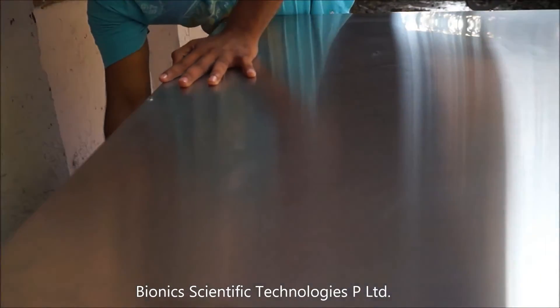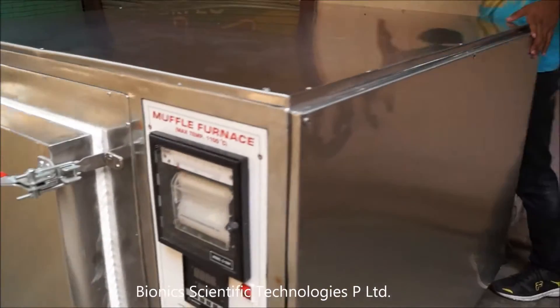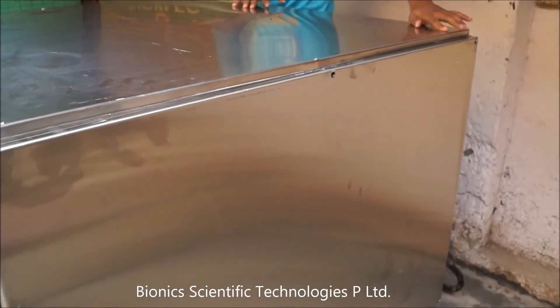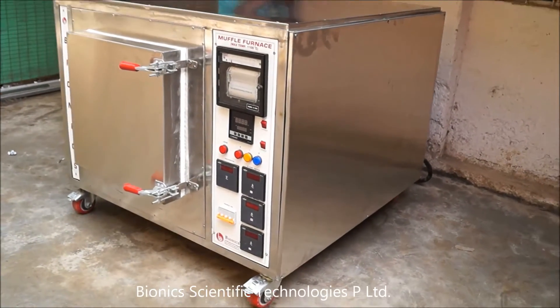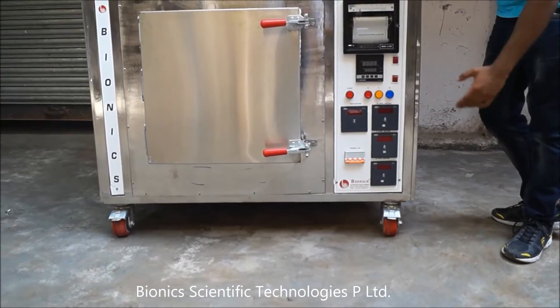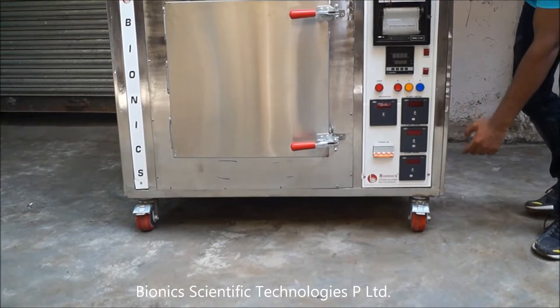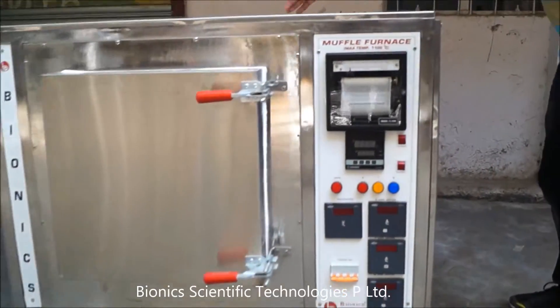As you can see, this Mokul Furnace is mounted on 4 wheels — 2 are in the front and 2 are on the rear side.